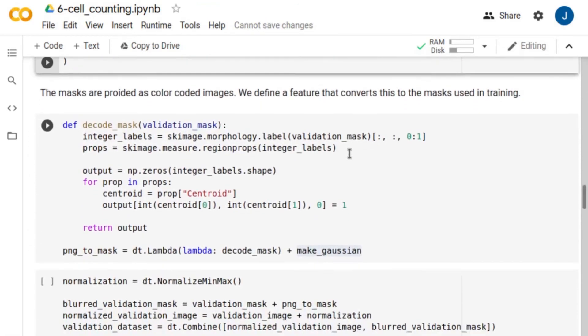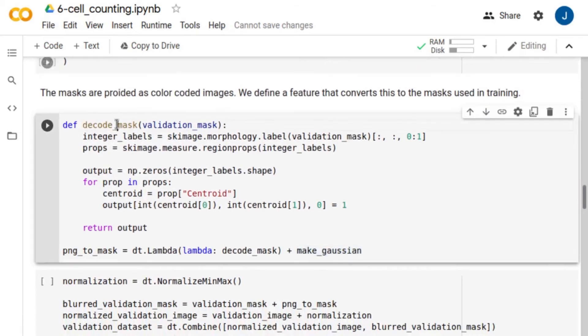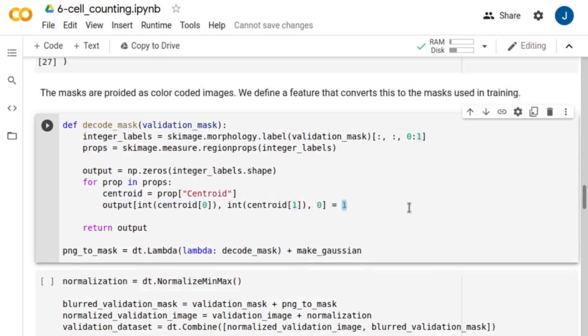The labels in this database are color-coded segmentations. Therefore, we need a feature that converts this mask into Gaussian labels. Using the decode mask feature, we compute the centroid of each labeled image region and, as previously, we assign one to the nearest pixel. Finally, we apply the Make Gaussian feature.